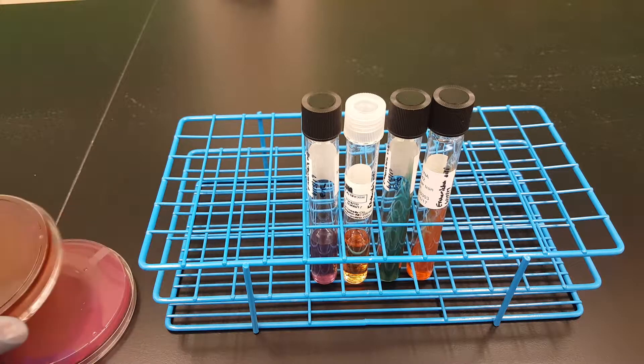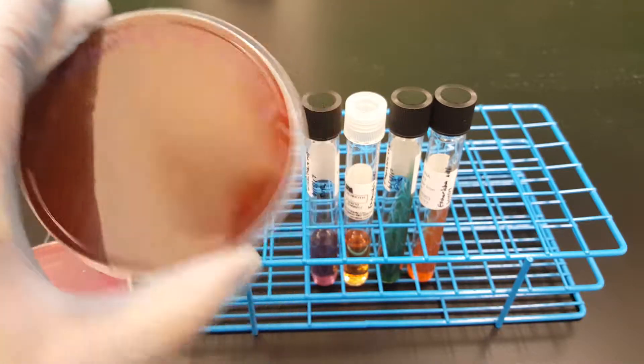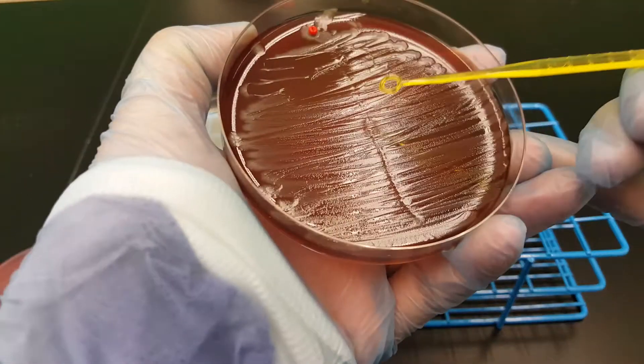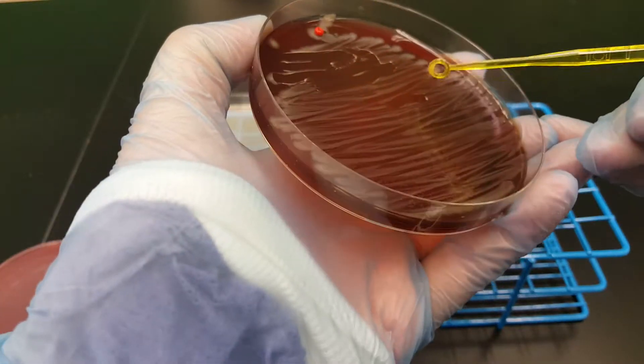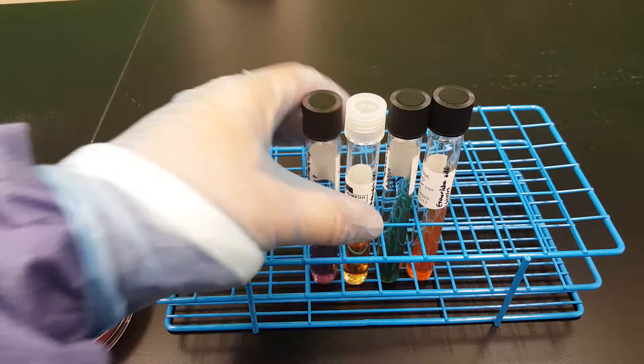Now we are going to inoculate each of these broths. You want to make sure to take the organism from a blood agar plate and not anything else, because you don't want to have any inhibitory component from another agar getting into the biochemicals.